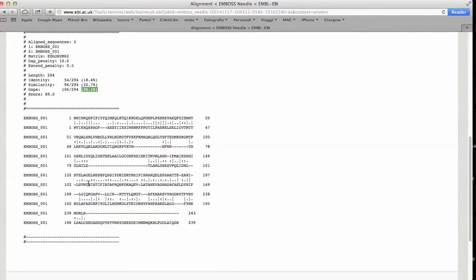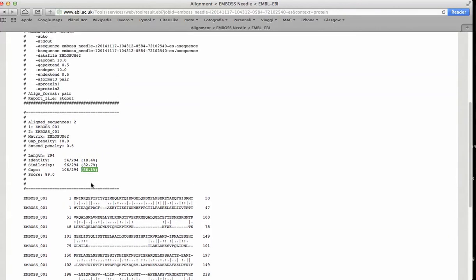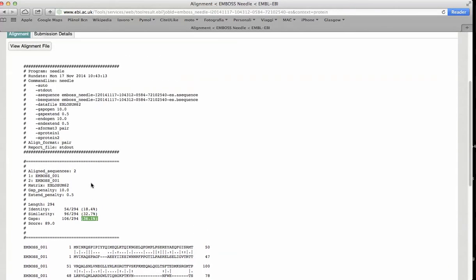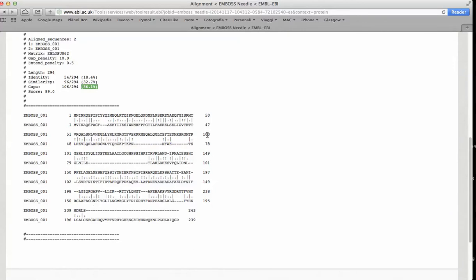Doing our local alignment of the two sequences. Based on this result, it is very difficult to establish a relation between the sequences because we are below the twilight zone of sequence similarity.